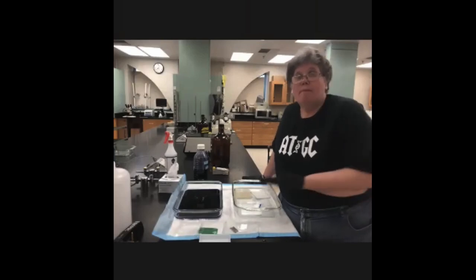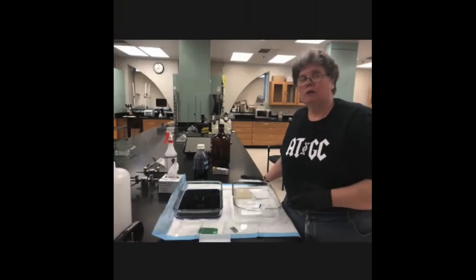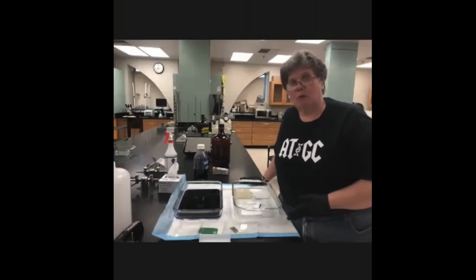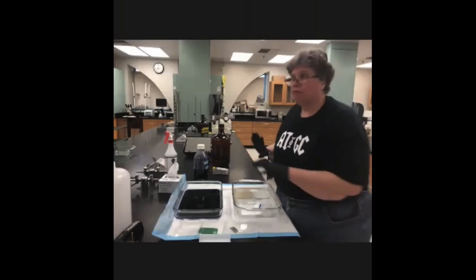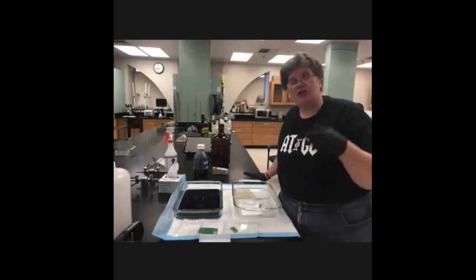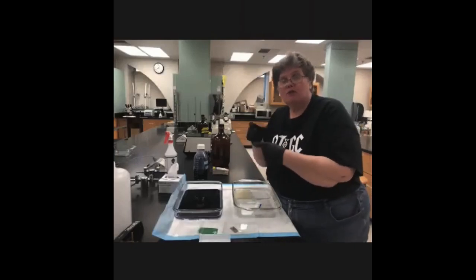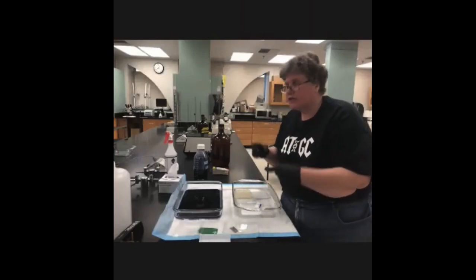keep changing it. But if you have multiple gels, because you can do multiple gels with this procedure at one time. Very often in lab, we're running 6 or even 8 gels at one time. Just like I showed you on the SDS apparatus, you can run one gel or you can run 2 gels at the same time on the apparatus.